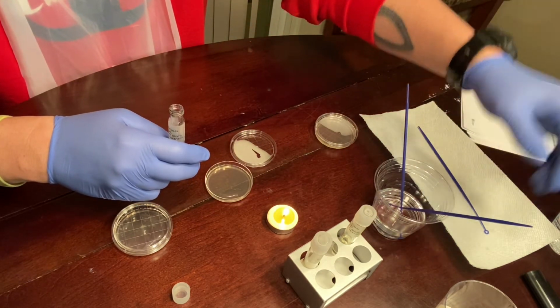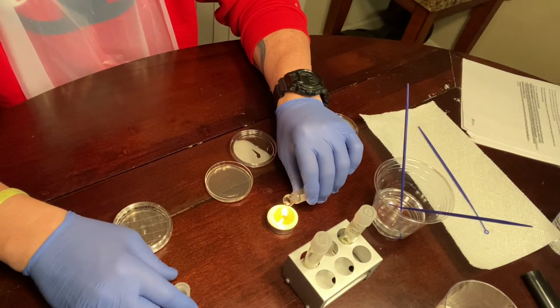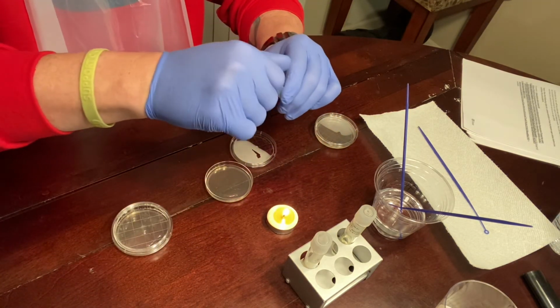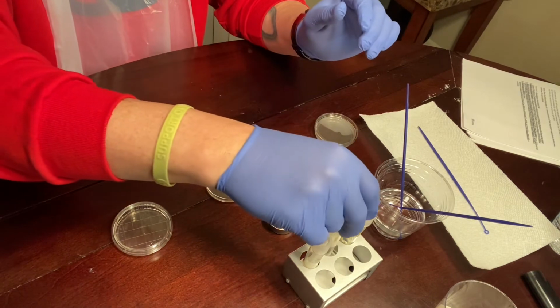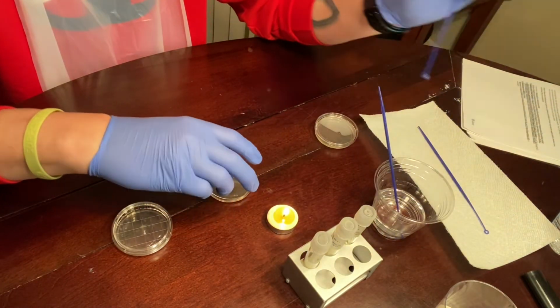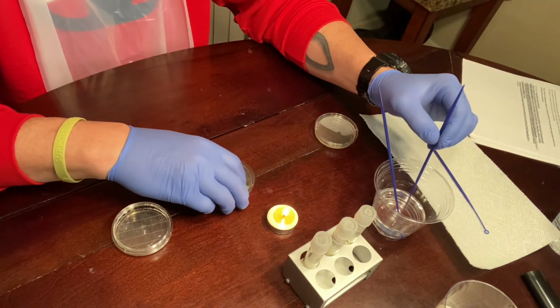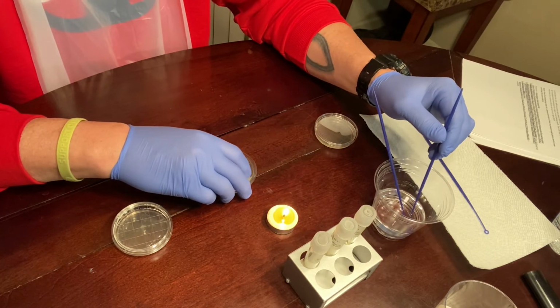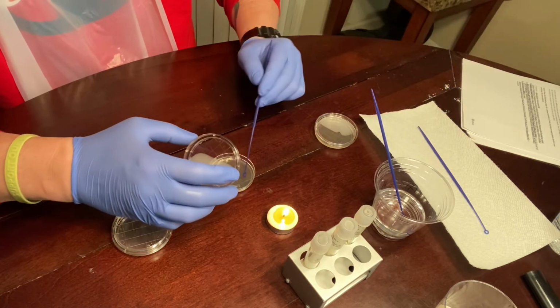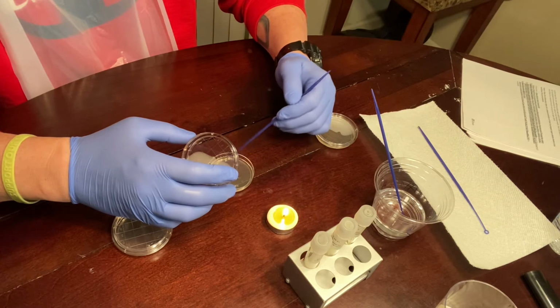Put that in the alcohol. Sterilize the rim again. Replace the cap. 20 seconds. So I'm going to borrow again from one and zigzag into another quadrant.